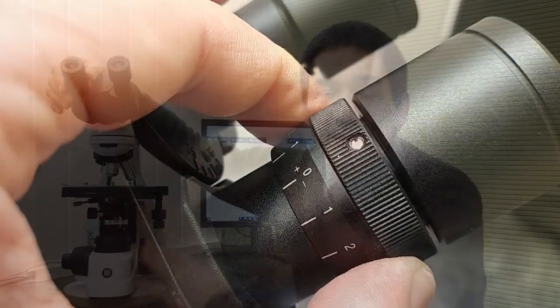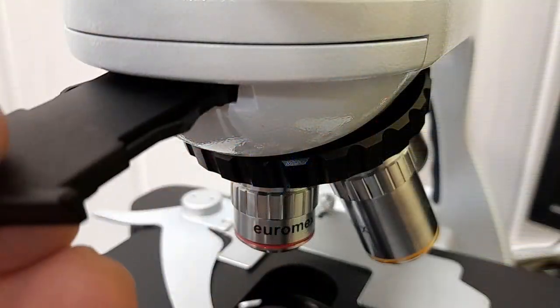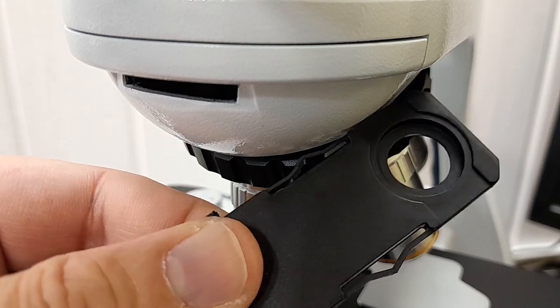Other standard features include diopter adjustments. Just like the iScope, you're able to rotate both eyepieces all the way up to adjust the height — a very nice feature. There is also a little filter holder here, which allows you to place a polarizing filter and analyzer in it, so you're able to easily convert the microscope for polarization work as well. I'm going to make a separate video on converting it to polarized work, which I think is a very fun project, especially if you're into amateur microscopy.